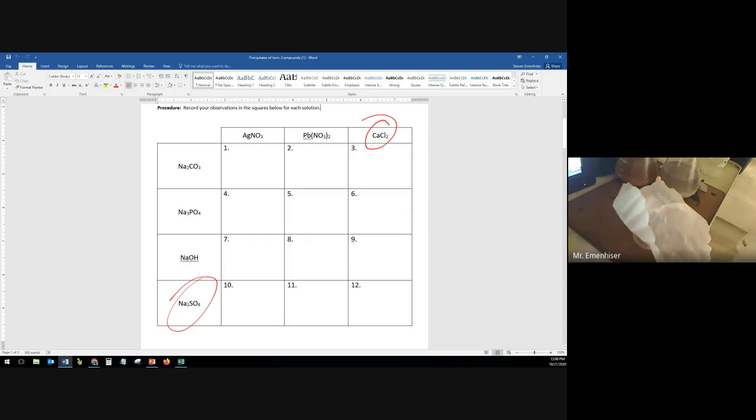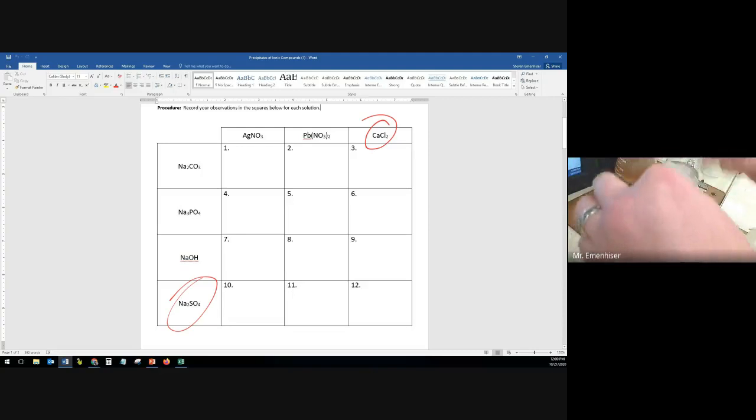Okay, let's check out some more solids. I just noticed it had a reflection. Okay, so let's put this one back in this beaker without touching it, I hope. I've got another white one, which is not that interesting, and I've got some others, but they haven't really solidified. There's not much to see. So I think that's it, guys. Thank you. Do y'all see? These are kind of cool looking. I'll wait and see what happens with those.